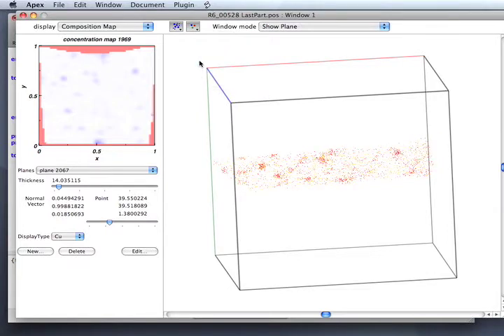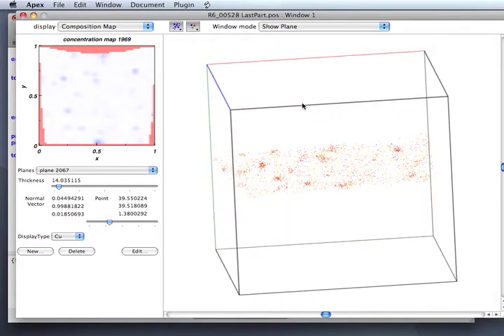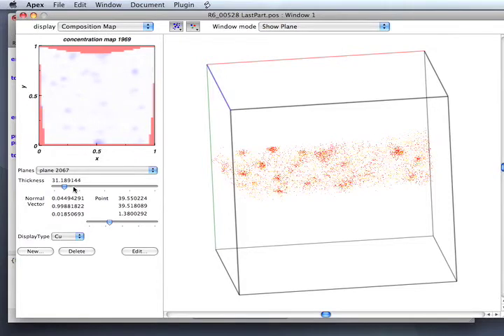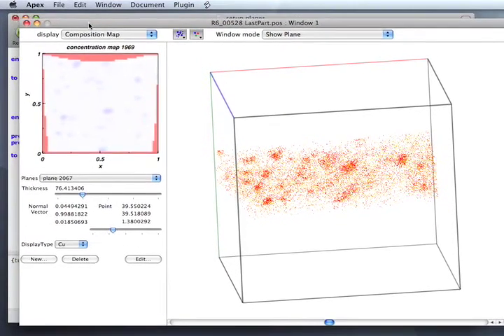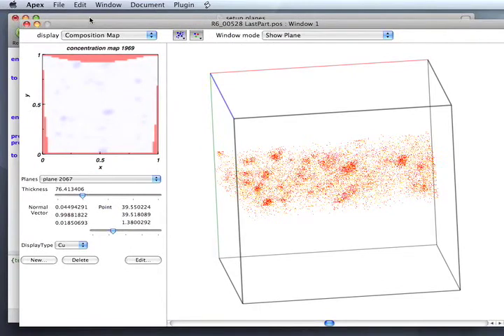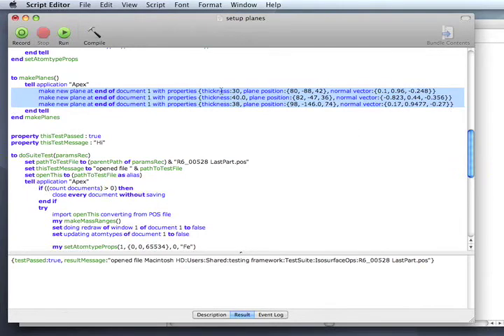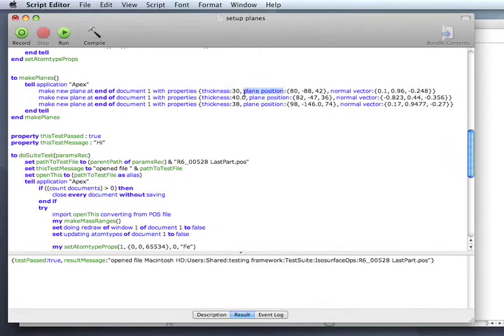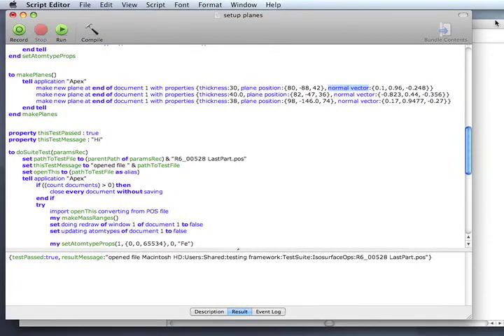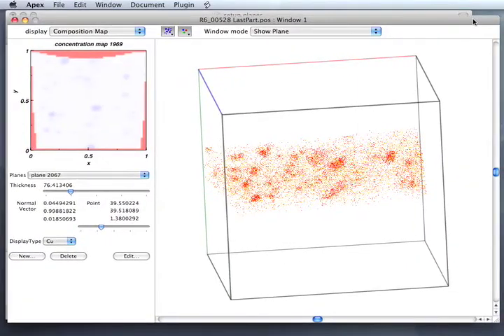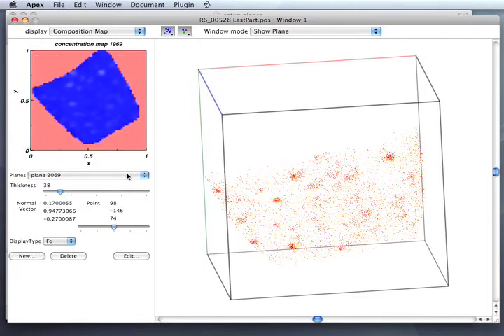So that's a new feature for planes in Apex. And of course, as always, these features are scriptable. In the script that I ran to set things up, I made three planes, supplying a thickness, a position in the plane, and a normal vector. In addition to the one that I dragged out in the beginning, there are now four planes defined. You can see them all here.